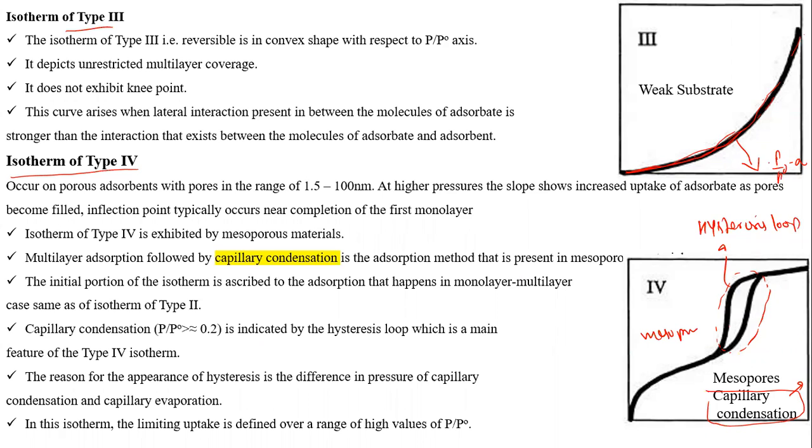Now what you have to do is, if you take the BET analysis of your sample, you will get an isotherm. You compare that isotherm with these isotherms. By comparing, you will find out which isotherm your material matches with and what the nature of your material is, whether it is porous, non-porous, mesoporous, or whether capillary condensation is occurring or not.